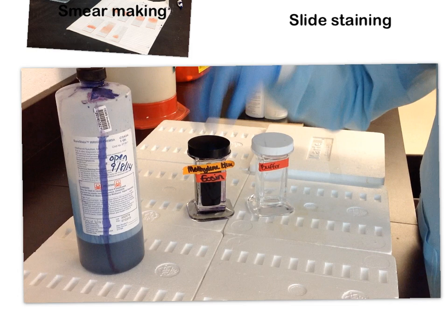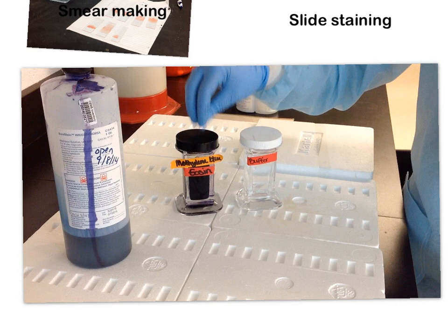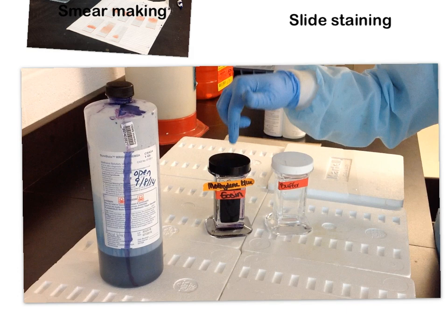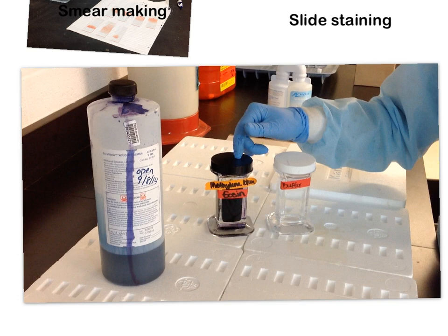To stain, open your Coplin jar of Wright stain, take your dried smear, and insert it into the trough. Immediately recover the jar, then let it sit for two minutes. During those two minutes, you might think staining is happening — but actually, no staining is taking place in the staining jar. What's happening is fixation: the methanol in the Wright stain is taking the cells and sticking them right onto the glass slide. If you took it out, dried it, and looked under the microscope, your cells would not be stained.